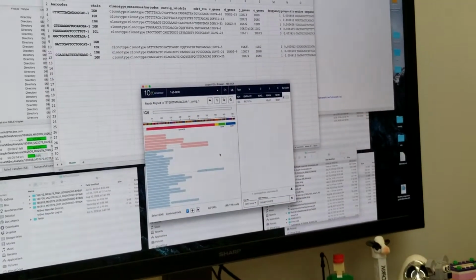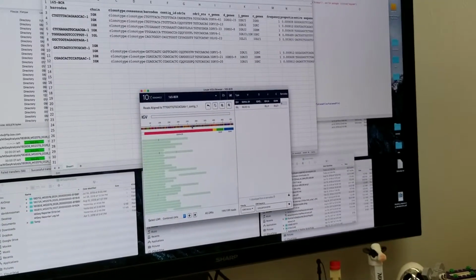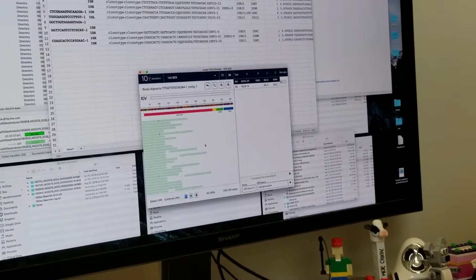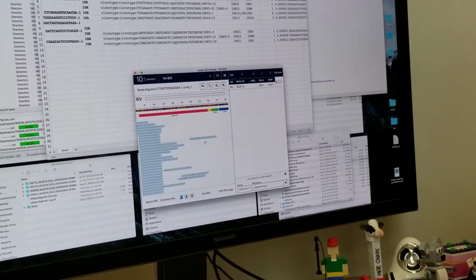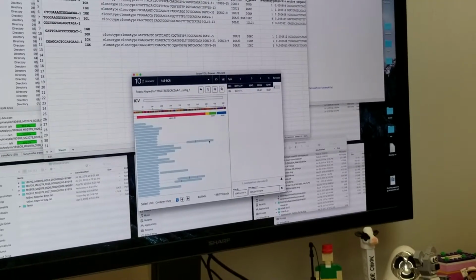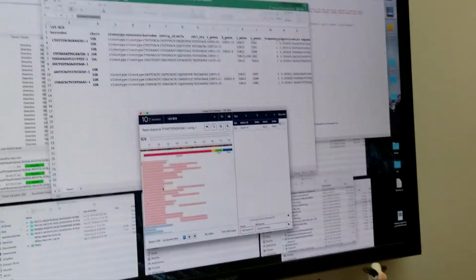So do you see one that goes through that? I haven't seen one at all down in the status. That's what tells me that I think this is not the reference to the human, it's the actual sequence of this particular barcode. But somebody down there should go through that area, right? Something should. Like that one goes all the way through, which tells me that I should see a deletion mark here, and it's not. Again, I still don't know what the colors of these different ones are.